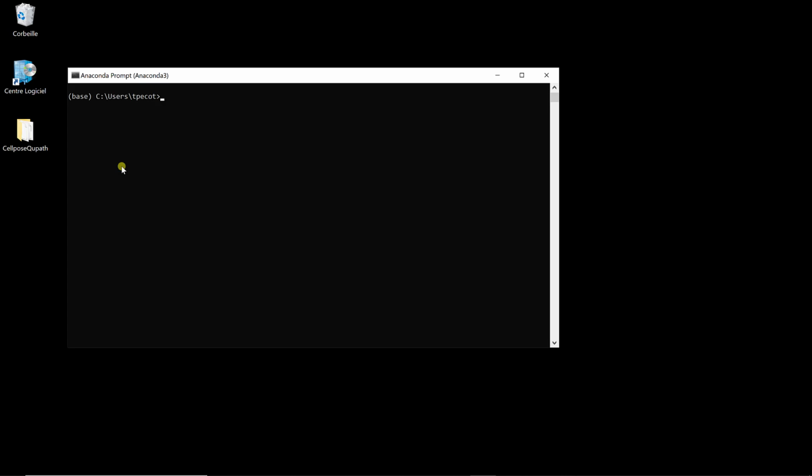And so you should never install something on your base system. Here you can see, you can read base. This is my normal environment, and you should never install anything on this. You should first of all always define a new virtual environment or activate an existing one. There are several ways to define a virtual environment. Here we're going to use the virtual environment venv, V-E-N-V.